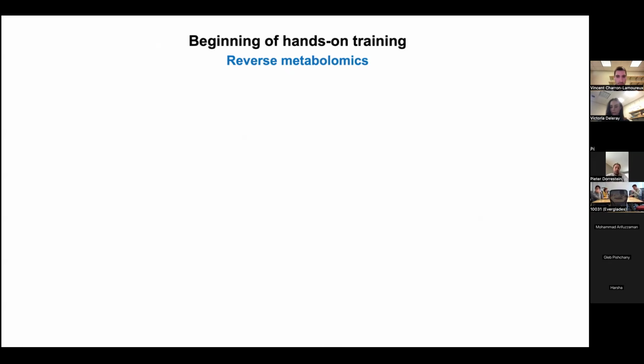MSMS patterns depend on instrument and collision energy. What's the default setting we should use to collect MSMS? So I would say in metabolomics, there is no default setting. Everyone has different instrumentation, different availability. And thank you, Helena, for answering in the chat. One of the beauties of reverse metabolomics is you can start with any MSMS and search the public domain, and it will change the hits that you get depending on what your input is. But really, I would say it's kind of a one-size-fits-all workflow.